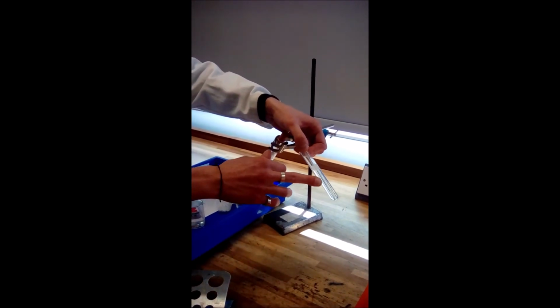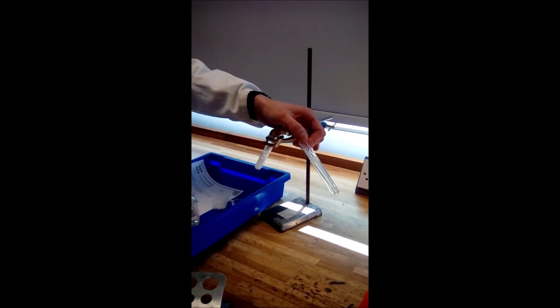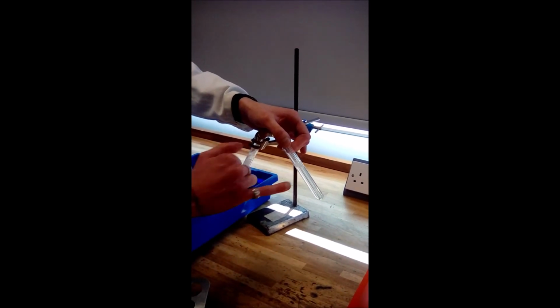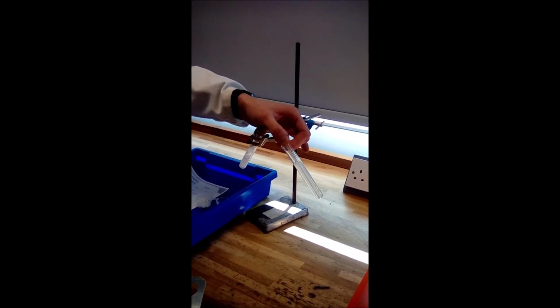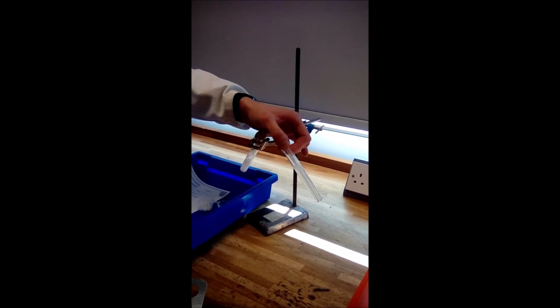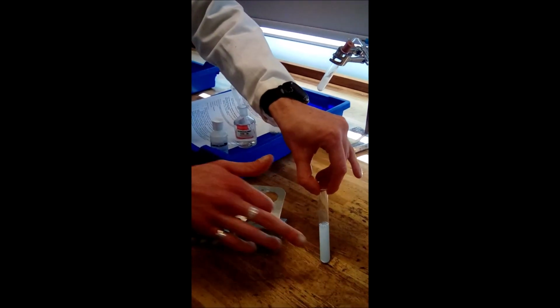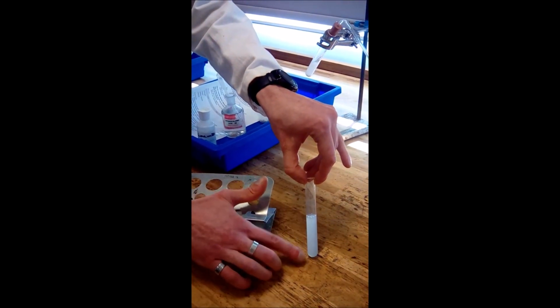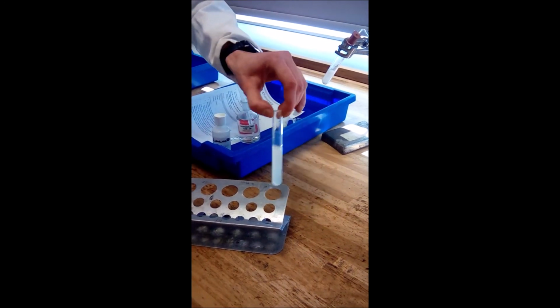So as you can see now, it's starting to go cloudy white. It's not clear anymore. It's starting to go this milky cloudy white color, which means that there is presence of carbon dioxide. So it started out perfectly clear, and now, as you can see, it's this milky color that we can see down here much clearer. So that means that there must have been carbon dioxide coming out of here.